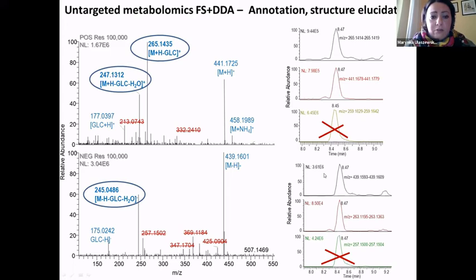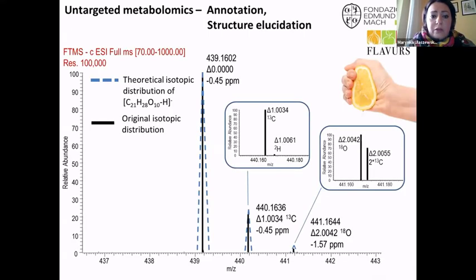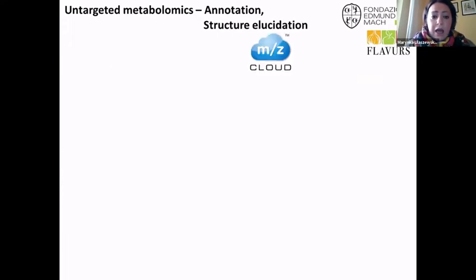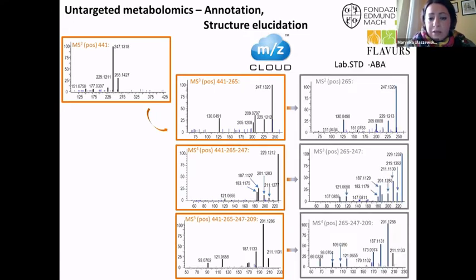You can find in the full scan not only the precursor ions, but also some species that belong to them, like loss of water or loss of the glucuronide moiety. Then you squeeze out as much as possible and assign the elemental composition, check the PQC, and see that it is statistically significant. And in the end, you perform a mass analysis.